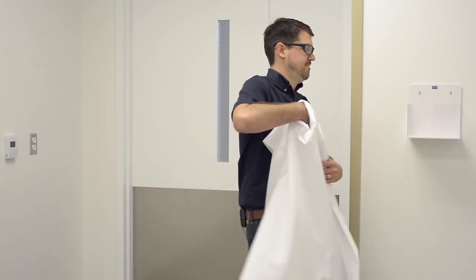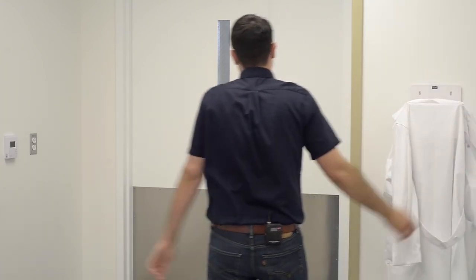A lab coat should be worn at all times when working with hazardous materials. The sleeve should remain rolled down, and you should take it off before you exit the lab. Food or drink are also never allowed in the lab.